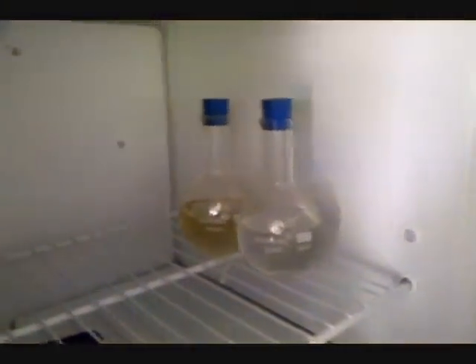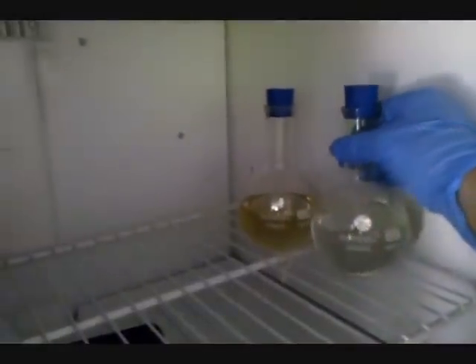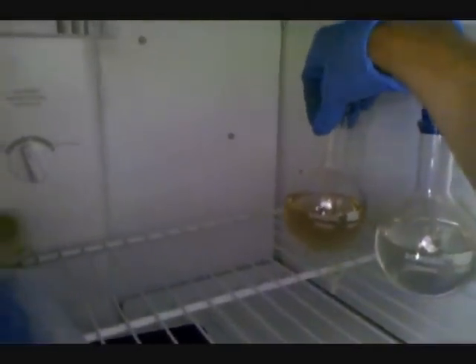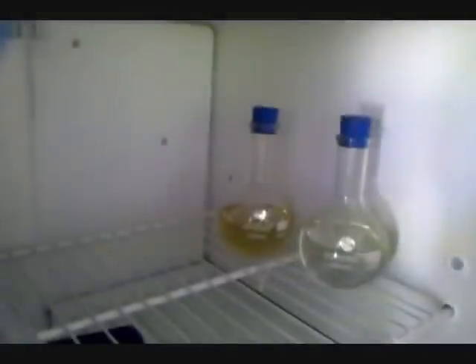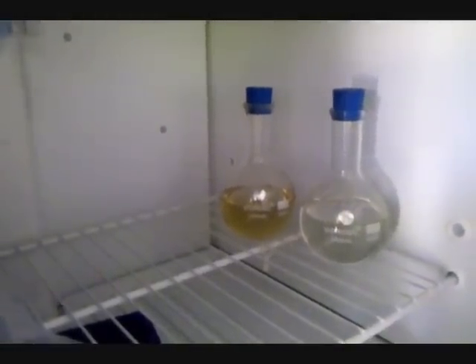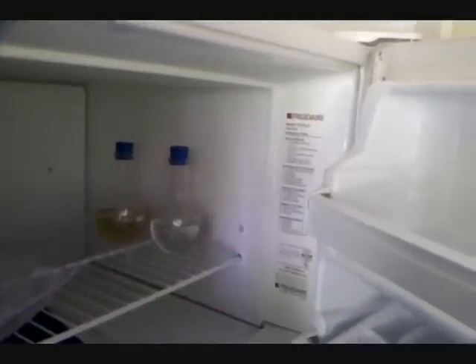The first step is going to be cooling down some ethanol, about 180 milliliters, and some concentrated sulfuric acid. I have 160 milliliters in a freezer until the glass frosts over, so it's about zero degrees Celsius. I'm going to skip over this part while they freeze and get back to you once that's done.